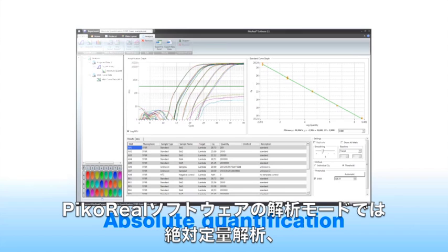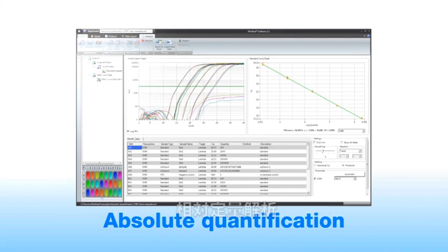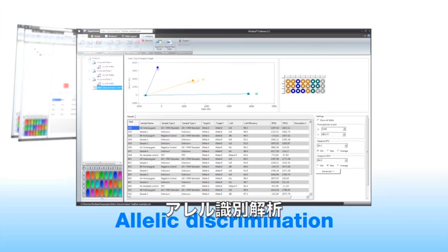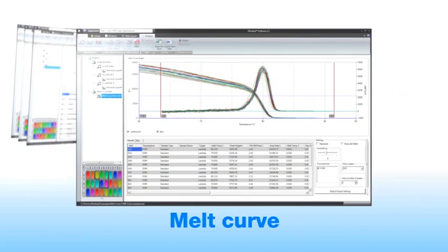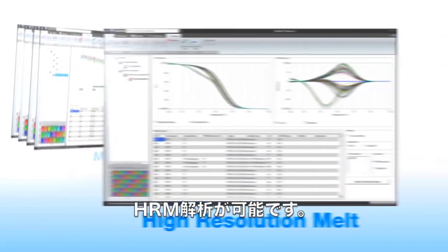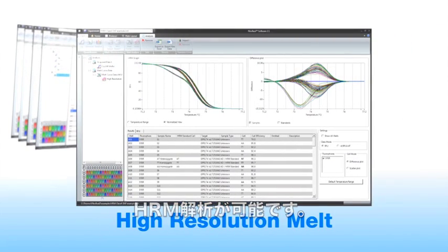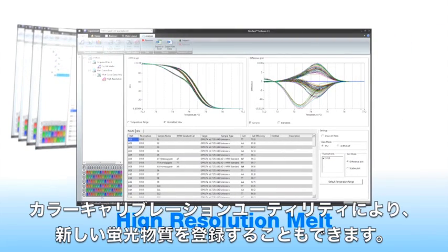The PikoReal software has analysis modes for absolute quantification, relative quantification, allelic discrimination, melt curve, and high resolution melt analysis. It also includes a color calibration utility for dye customization.